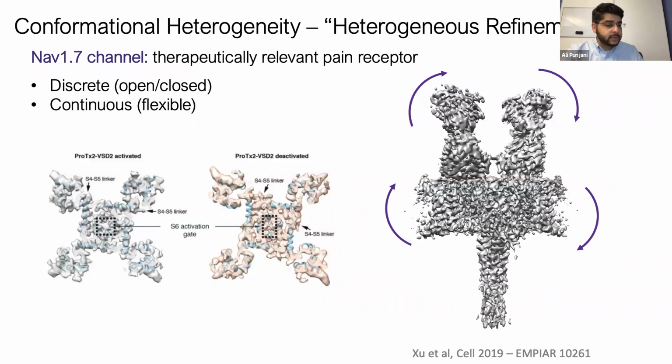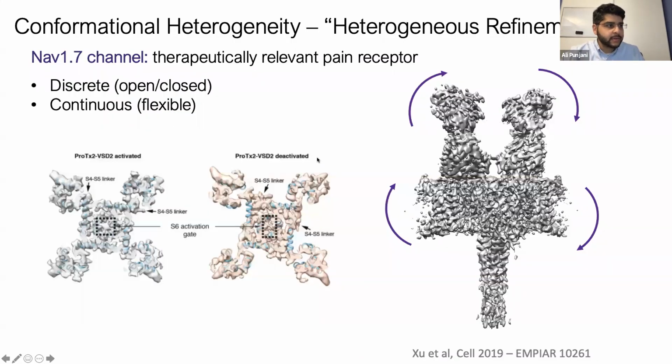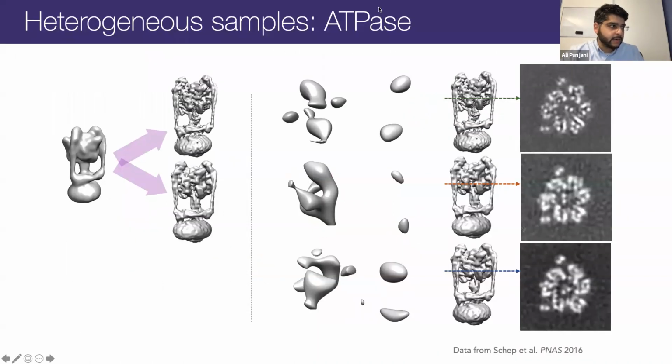So what we need in order to deal with this scenario is a new way of thinking. We've seen a similar notion of conformational spaces in the discrete case, for example, this ATPase molecule that we earlier saw when we were talking about multi-class heterogeneity. This is a very interesting molecule, and there have been several follow-up studies by John Rubinstein's group here in Toronto, who's been working on ATPase molecules for quite some time. They've gotten some amazing, beautiful, very high-resolution structures of all kinds of different ATPases.